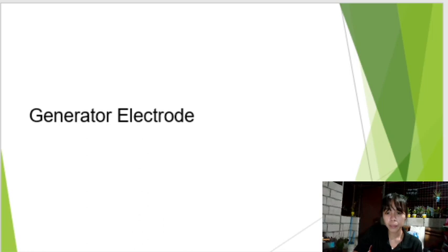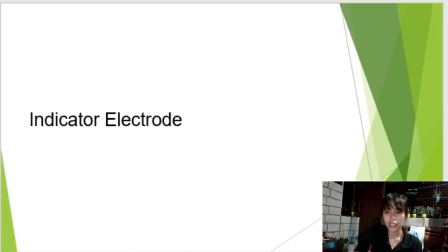And para naman po sa indicator electrode, if yung indicator electrode po is nagkakaroon po siya ng 1.5 microgram per minute or 0 microgram per minute na hindi naman po yun yung kailangan nating malaman, ibig sabihin baka meron po siyang short circuit kung saan defective na po and kailangan na po natin siyang palitan. And that's all for maintenance and troubleshooting of coulometric titrator.